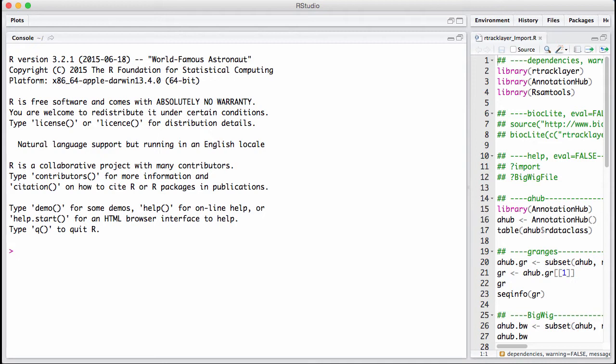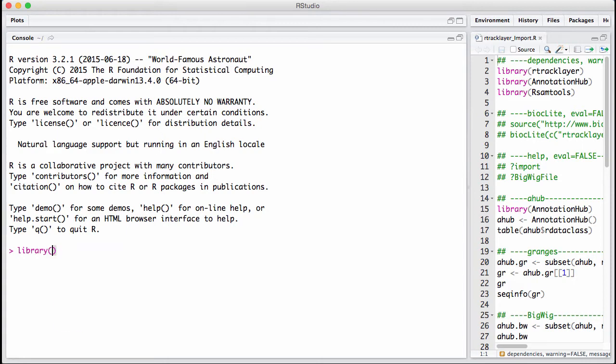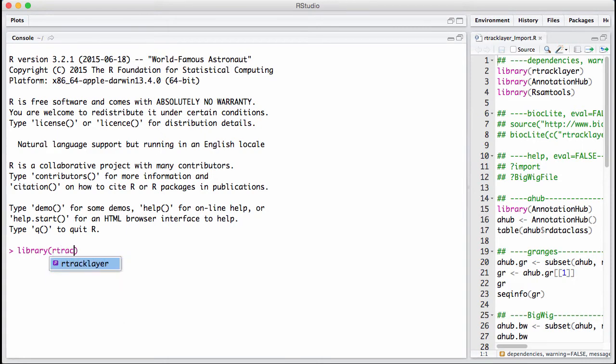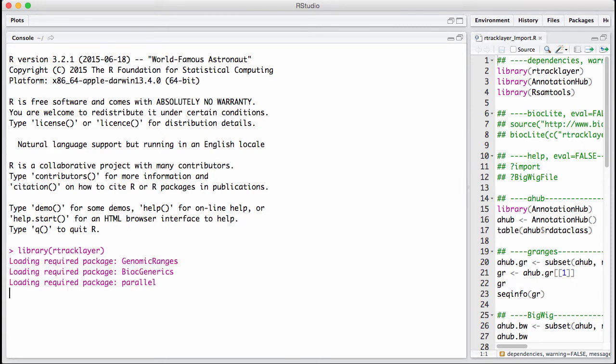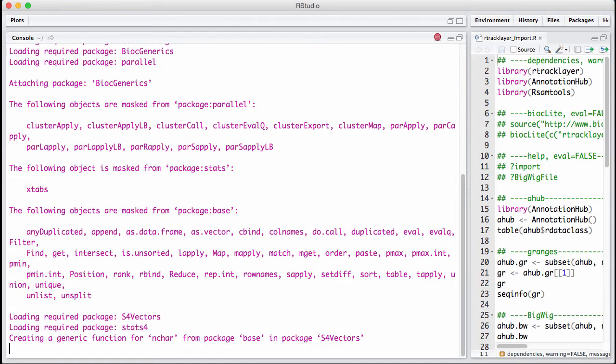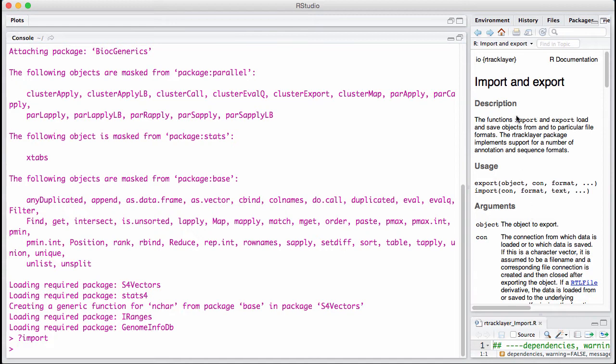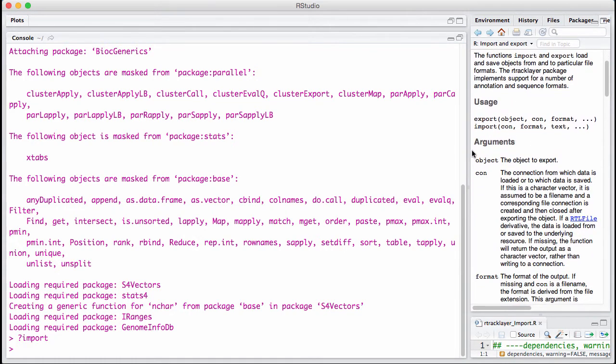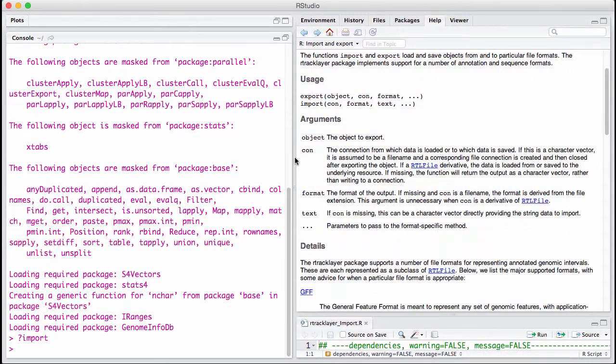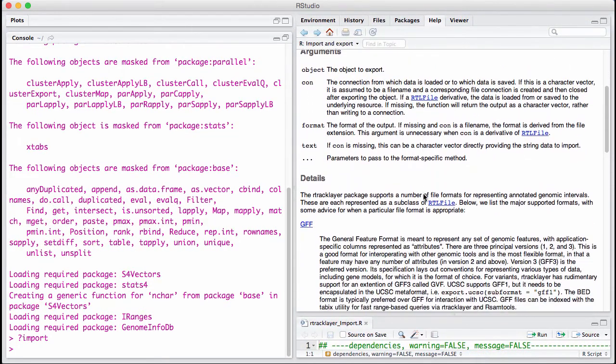The main way you read in these files into R is through the import function. The import function is a method with different versions depending on what type of file you're importing. Let's start by loading up RTrackLayer and look at the help for the import function.